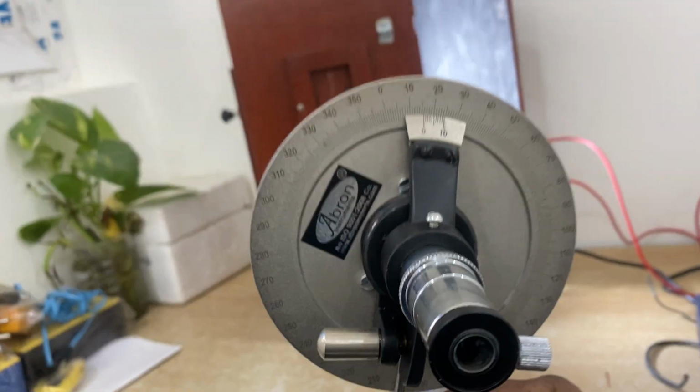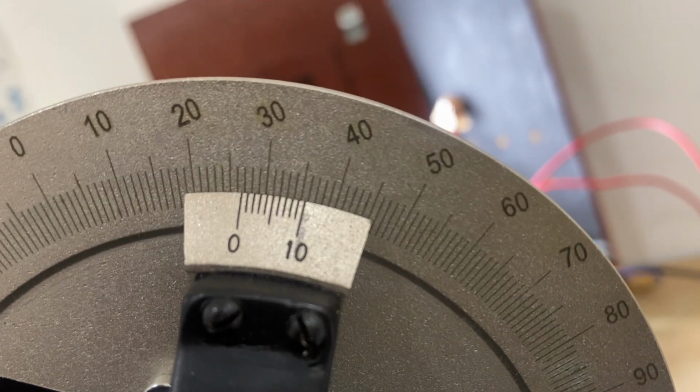See this, half dark is starting. Keep moving, and see the dark is there. Full dark will be there. You cannot see. Now again I am moving it to make it whiter in the same direction. In the same way I am moving it to the other side so that the white is there. See this. Now this is white, and the reading has to be on the back side. This is where both sides are white. You cannot see. So the reading is 226 now.